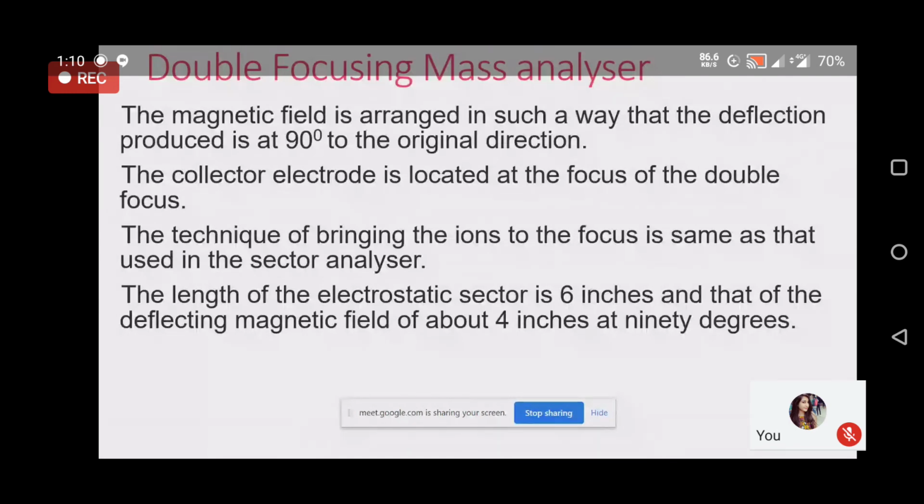No, so one electrode, they are curved. That is the only difference. Instead of having two parallel metallic plates acting as two electrodes, positive and negative, you have got them curved. But one electrode will be connected to one terminal, the other electrode will be connected to the other terminal. Then only the electric field can be applied. Okay? Okay, sir. Thank you. The field application is possible only when the two plates are connected to two terminals of the DC supply.